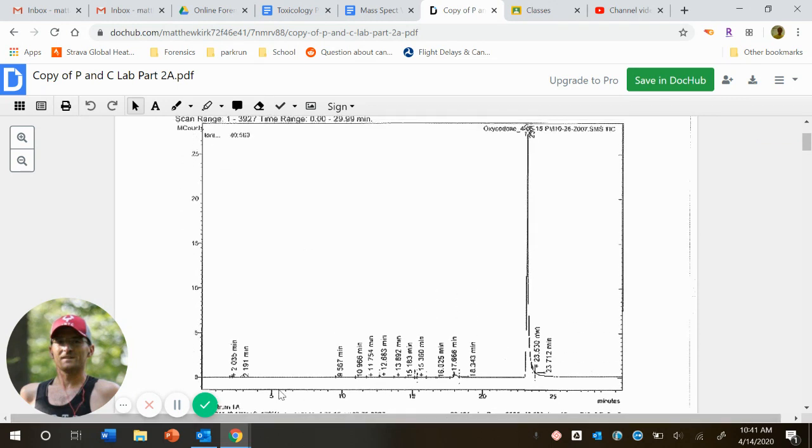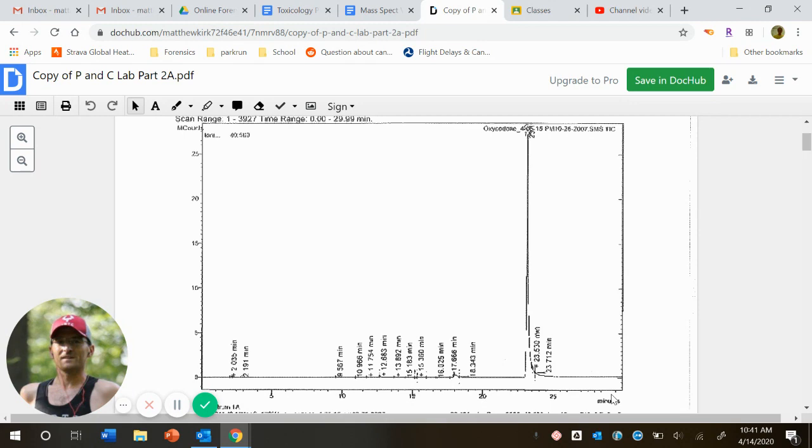And for gas chromatography, our x-axis is minutes, because remember our x-axis is retention time. Remember that tells us how long it takes for our substance to go through the column.